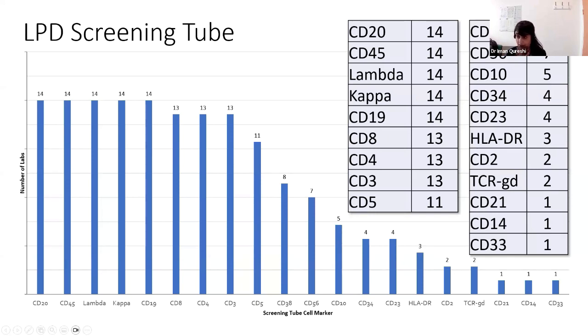And as you can see, we've got some very common ones that all labs, if not all labs, are using. But then as we get down to the smaller numbers, there are some that are uncommon. And that's probably because we are including quite specialist labs as well.